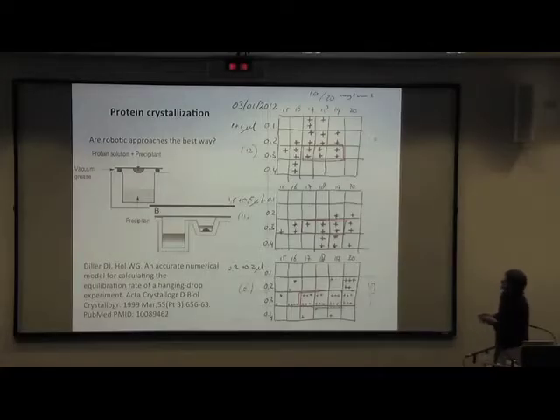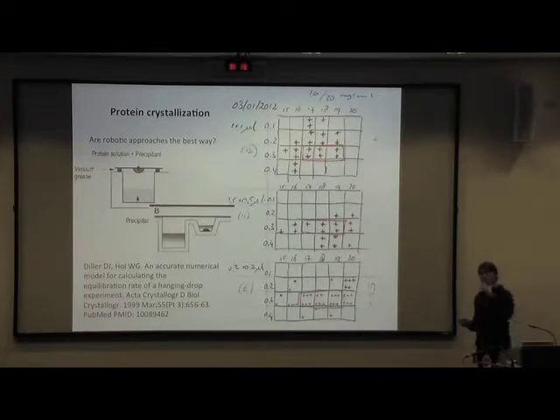And then there's another reason: typically in a hanging drop where we use a larger volume, larger setup, the air in between your drop and your buffer is much bigger. And it takes a longer time to completely be saturated and therefore affect your drop. And again, you're slowing down the process of crystallization, which gives you more chances of actually getting a hit.